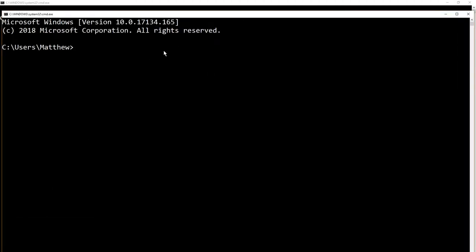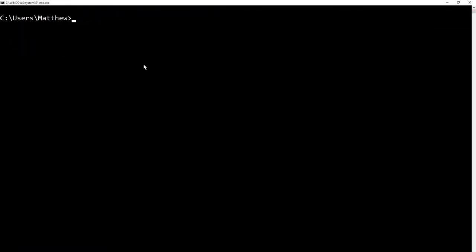Okay, and there's a new command line. We don't need two of those, so I'll close that. So, press cd for change directory. You can then paste by right-clicking on the mouse. You can't just hit ctrl-v yet, or you might now, I use an older-fashioned way, hit enter.